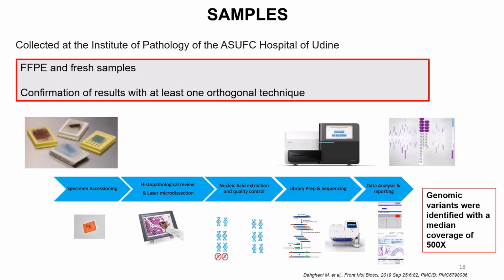As you probably know, in a surgical pathology lab, FFPE, formalin-fixed paraffin-embedded samples, are considered the gold standard for preserving tissues. By carefully addressing these aspects during DNA extraction for FFPE samples, researchers and clinicians can optimize the quality and suitability of DNA for NGS analysis, ensuring reliable and accurate genomic data for clinical and research purposes.